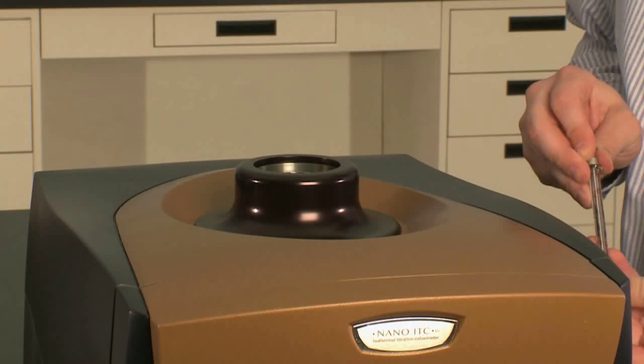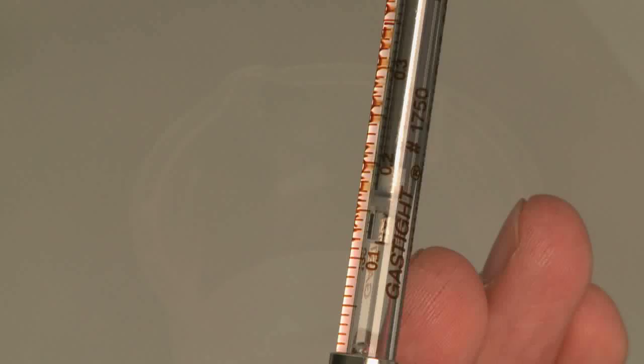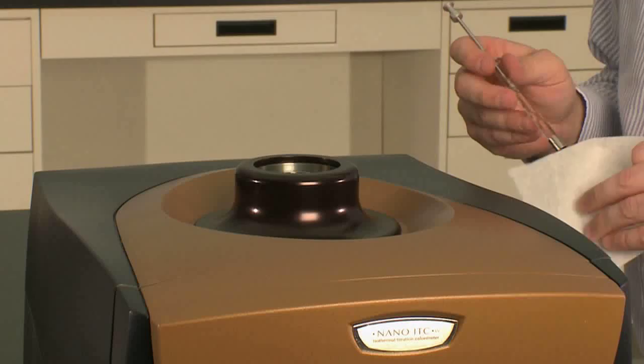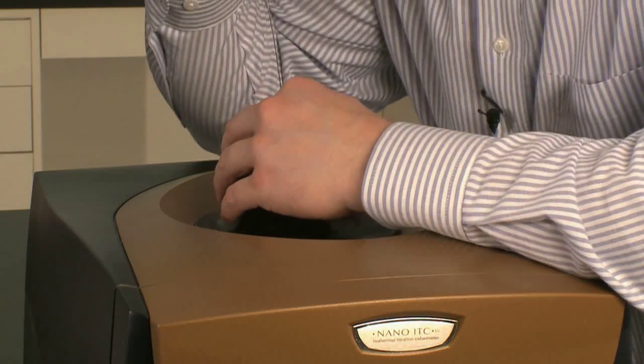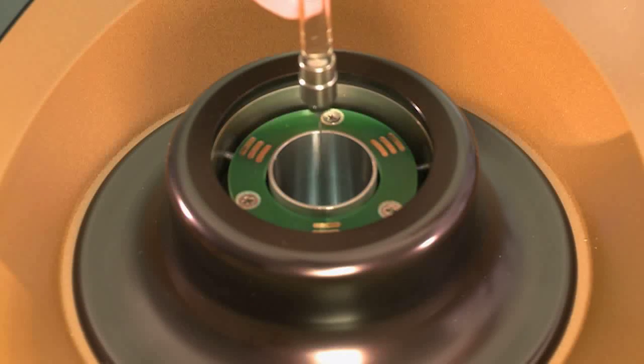With a half milliliter syringe provided, you want to load about 300 to 350 microliters of water in the reference cell. I always use water because most liquids you use are aqueous solutions, and water is the most inert and will balance the heat capacity to the reference side.